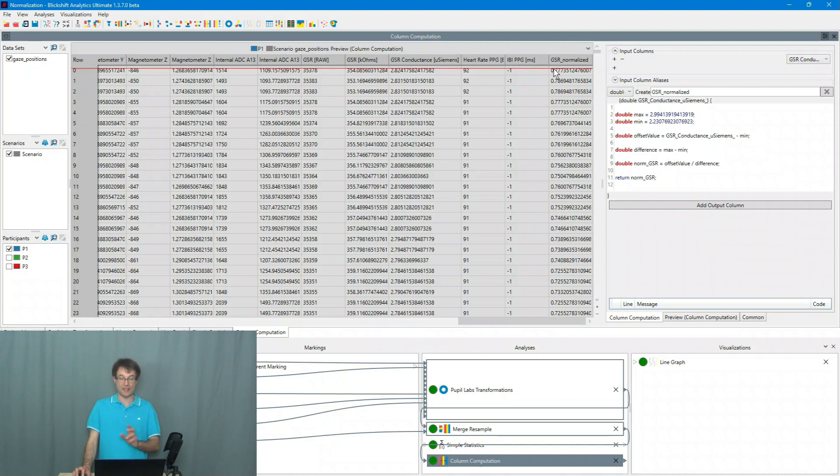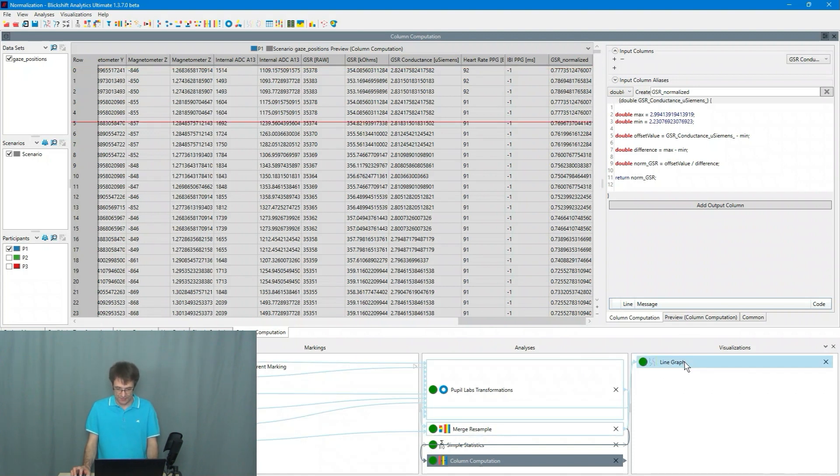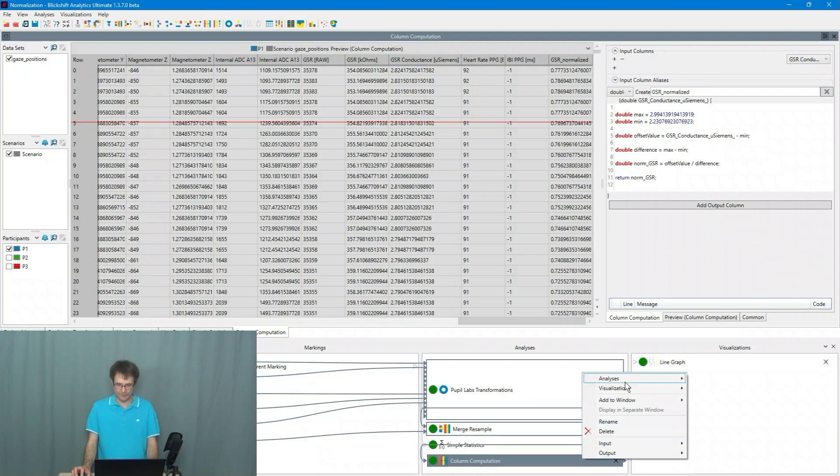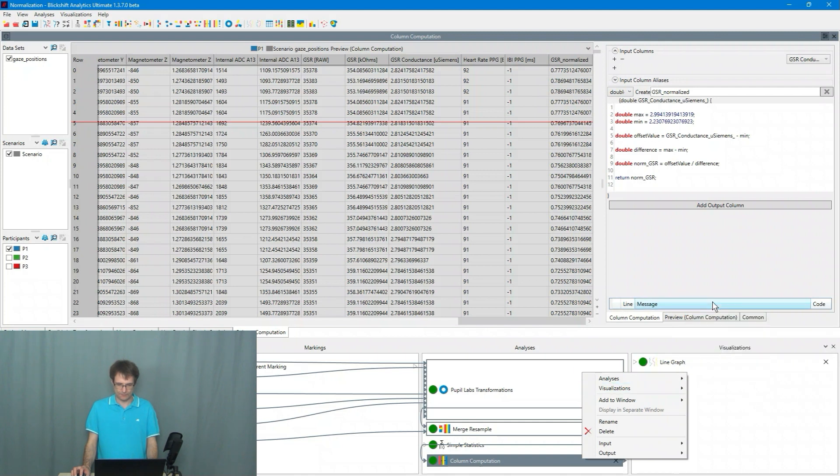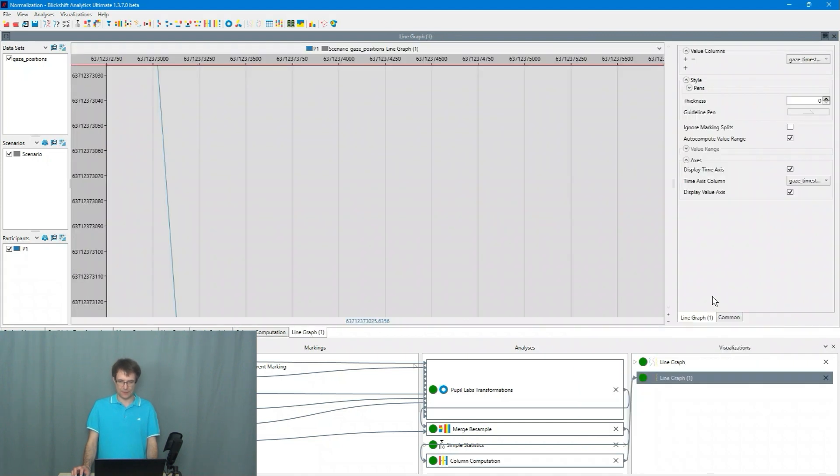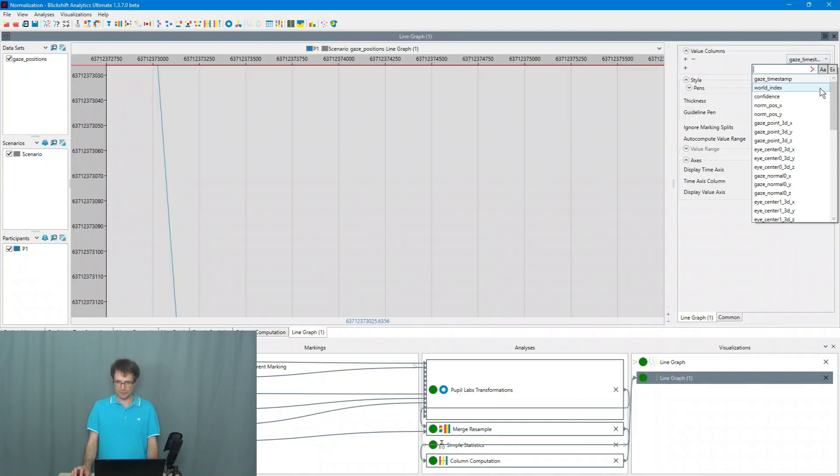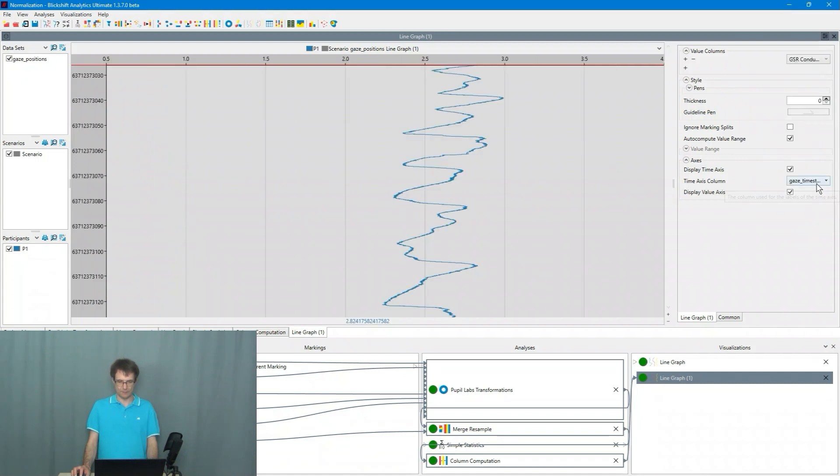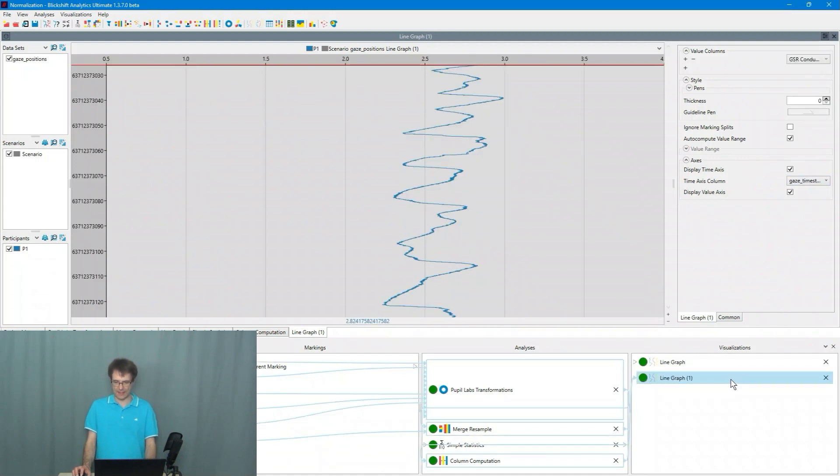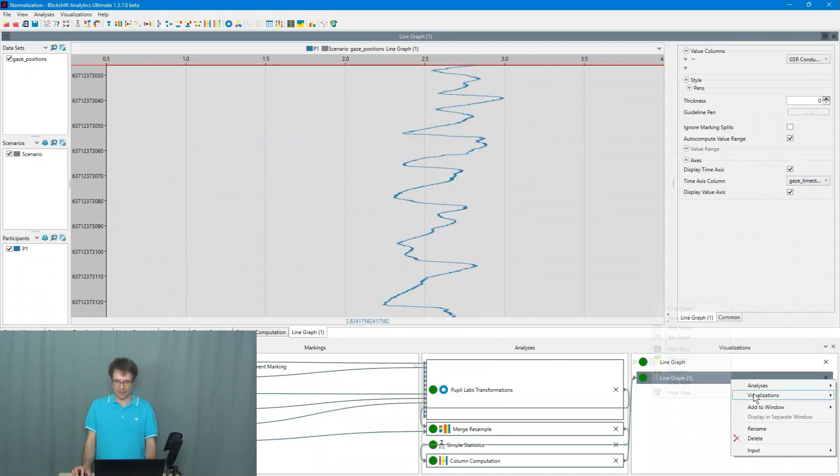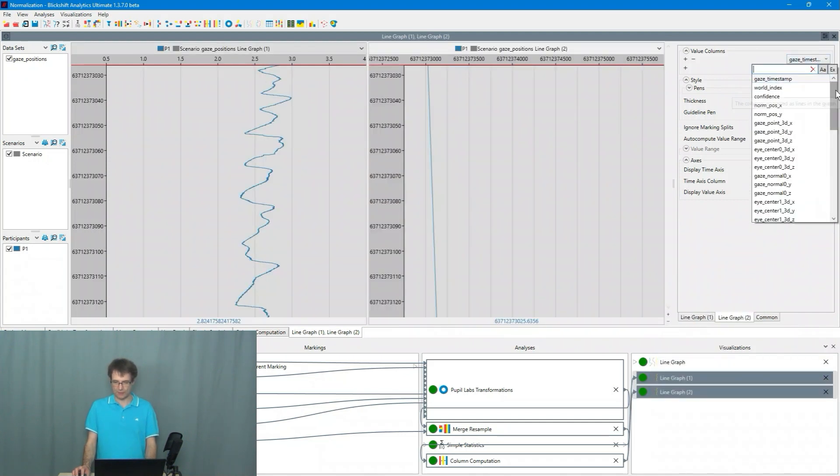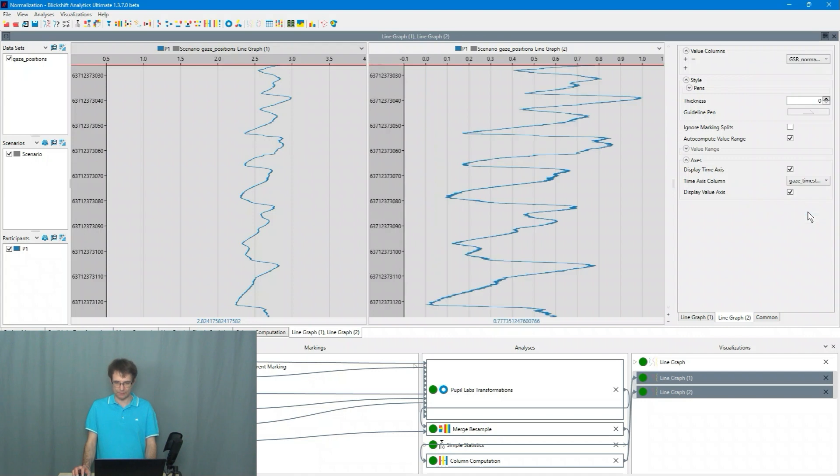And now let's have a look what happened. So I have here the line graph. I create a new one. Line graph. I choose the original data stream. And I add another line graph to this window showing me the normalized value.